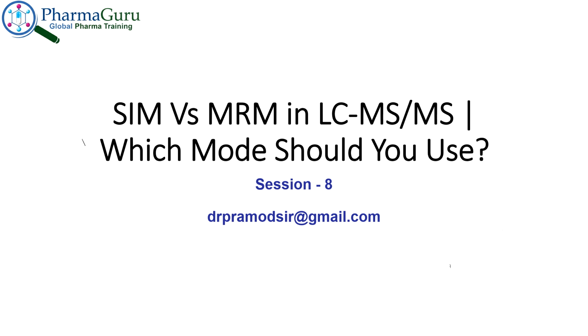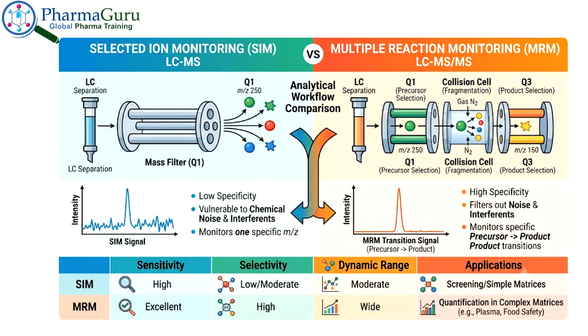Namaste. In this session, I will teach you SIM versus MRM in LCMS, which mode you should use and why.